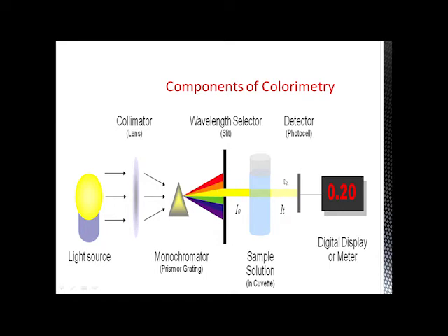Next, considering the monochromator, it consists of an entrance slit, then an absorption or interference filter, then a prism or diffraction grating for wavelength selection. A particular wavelength can be selected.